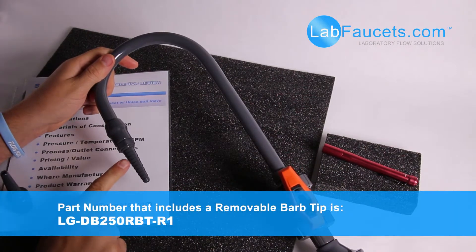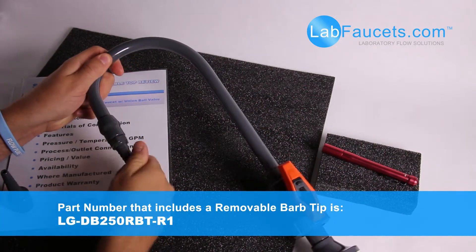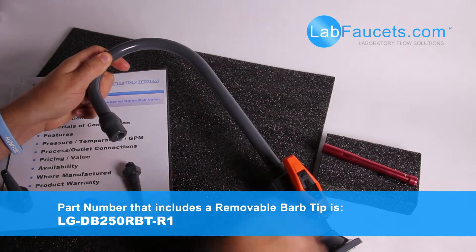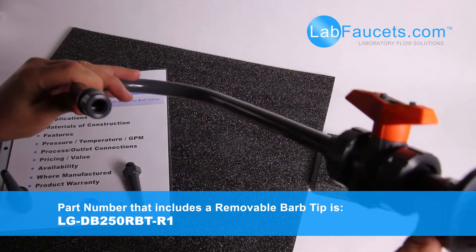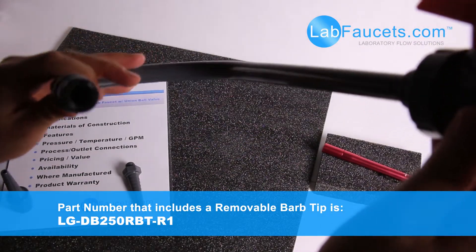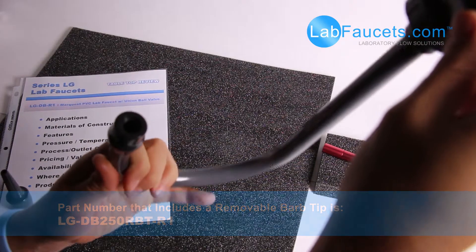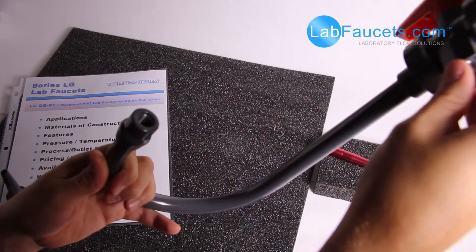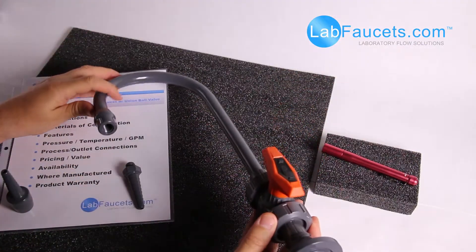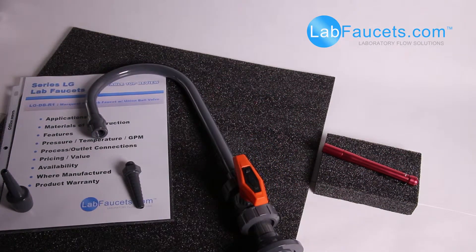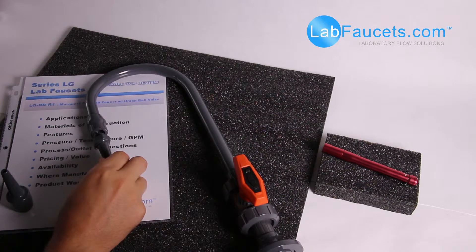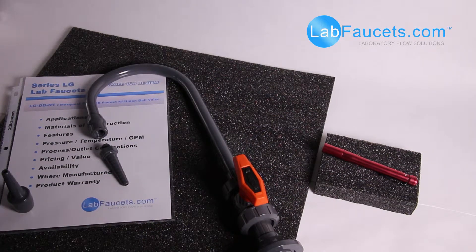When this serrated barb tip is removed, it leaves a quarter-inch female NPT thread. So if you want the option of adding a 0.2 micron capsule filter or an aspirator, other accessories, having this removable barb tip is a big bonus.